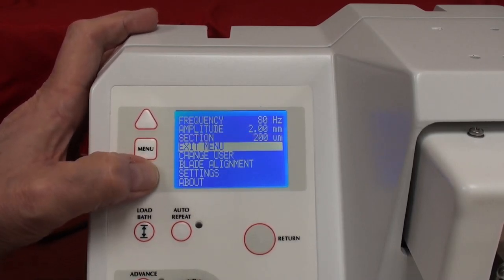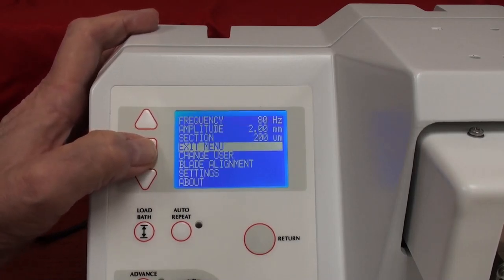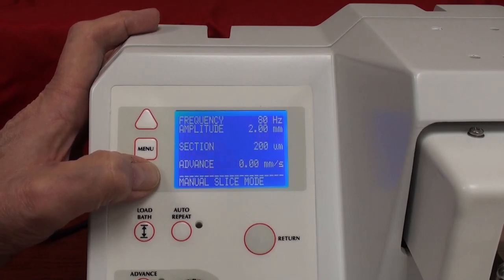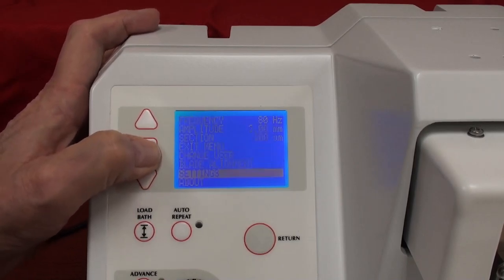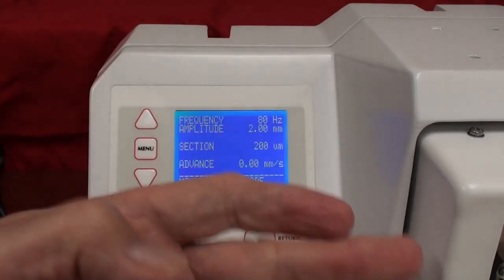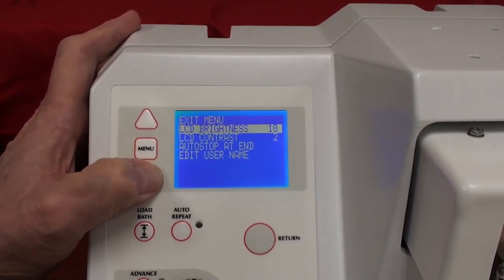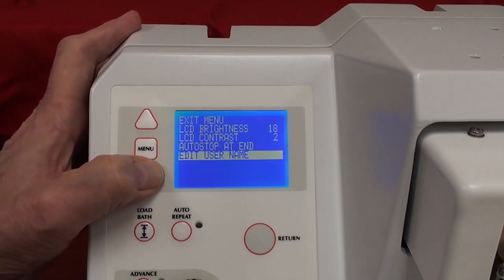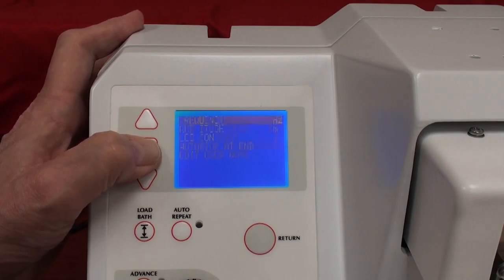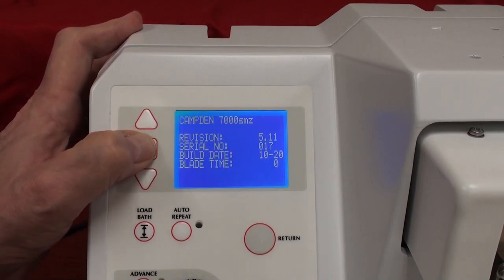The next selections are exit menu and change user. Blade alignment is part of the Opti-Cal system, which we'll discuss shortly. Settings gives you LCD brightness, contrast, and whether sectioning stops at the end or beginning of travel — I leave it at the default auto-stop at end. You can also edit user names. The about screen tells you what the instrument is, the software revision, the serial number, and the build date.